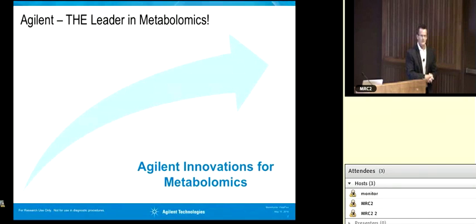So you're going to specify a list of metabolites, right? So back to the central carbon metabolism example, you look for the TCA cycle and you look for glycolysis. So by that logic, we came up with a piece of software called Pathways to PCDL. And the premise here is that this is a utility that has pathway content from BioCyc, MetaCyc, KEGG, and of course WikiPathways. And so you can select the pathways that you're interested in and pull down the metabolites that would be associated with those.